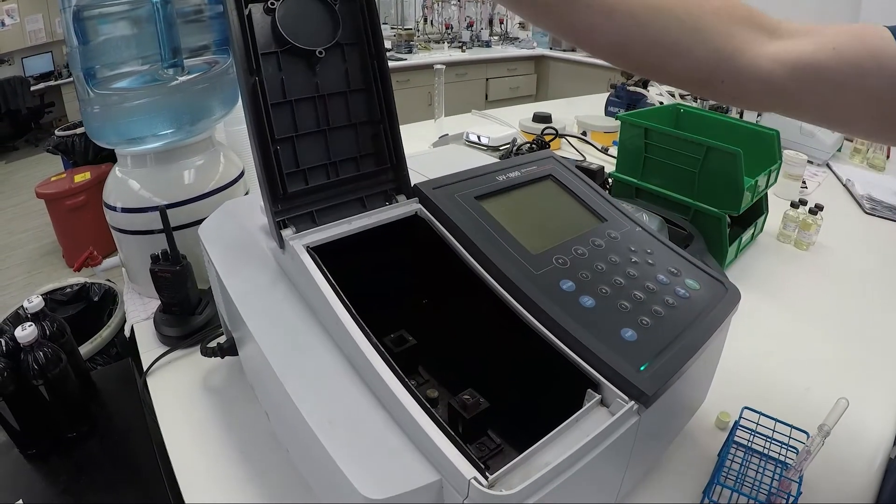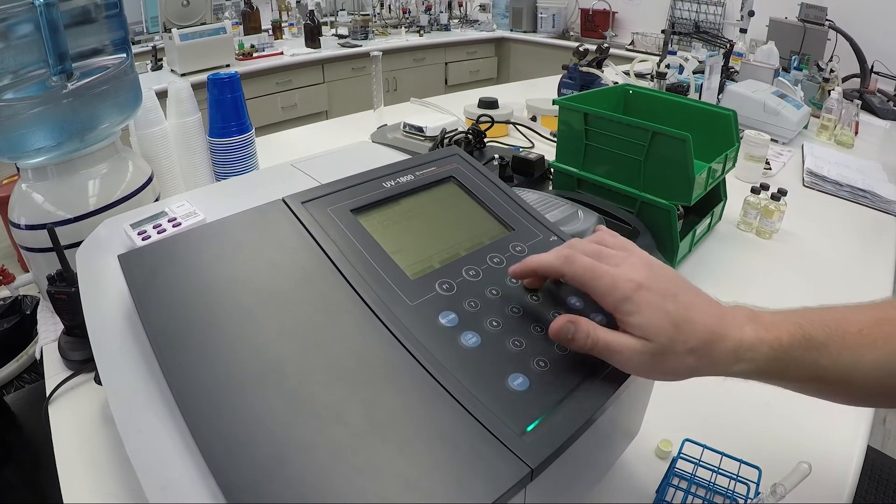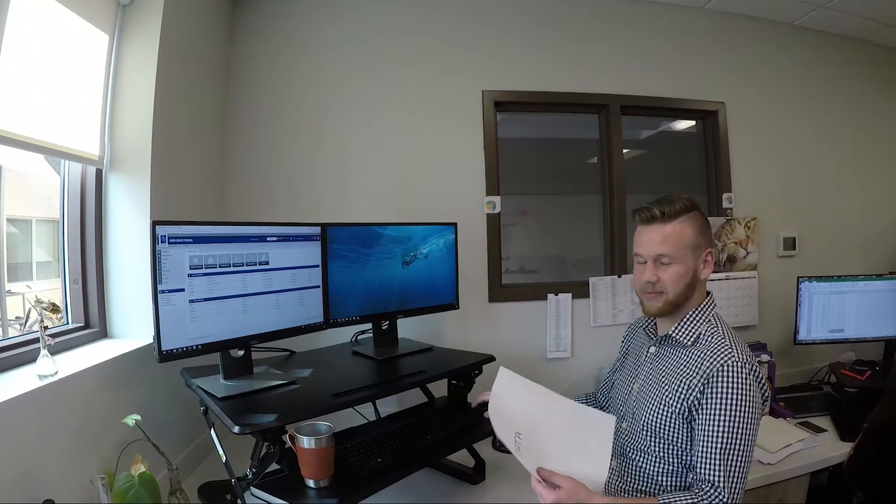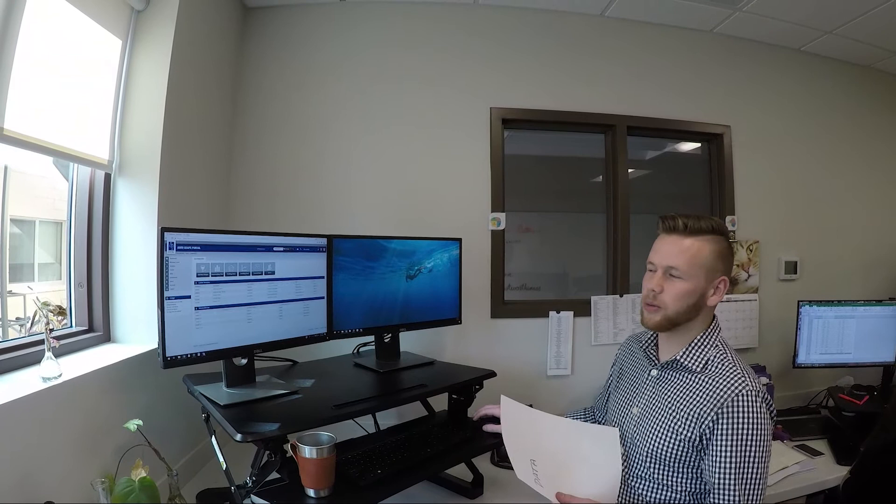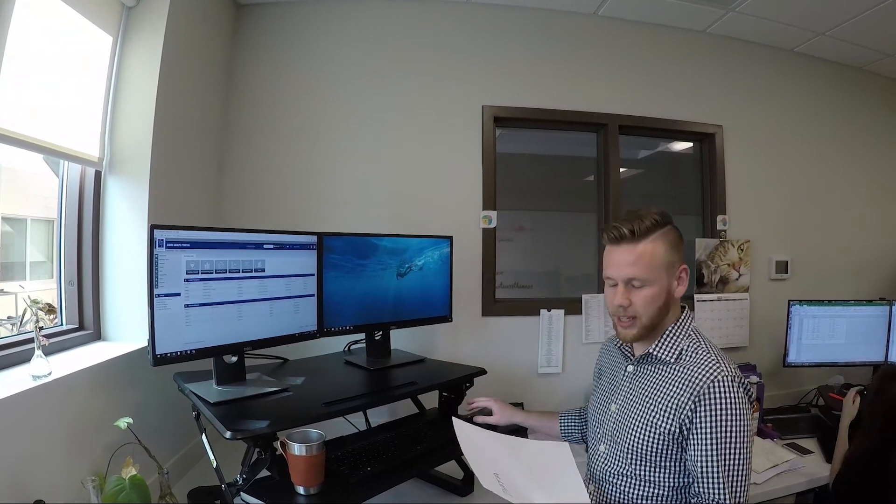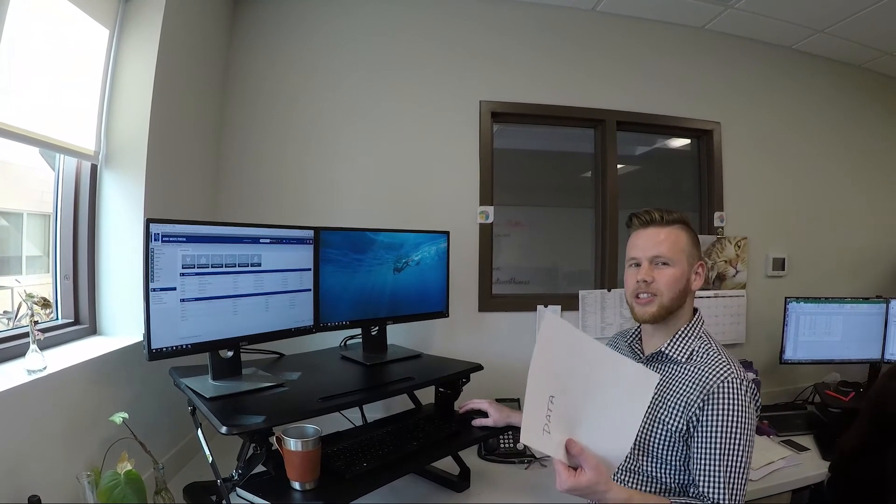So now that we have our spec data for all four blocks Montepulciano, we're going to input that into the grape portal on the AWI wine cloud website. That's going to give us back three numbers: total phenolics, total tannins, and total anthocyanins. We can use that to make real world decisions in the vineyard or in the winery.